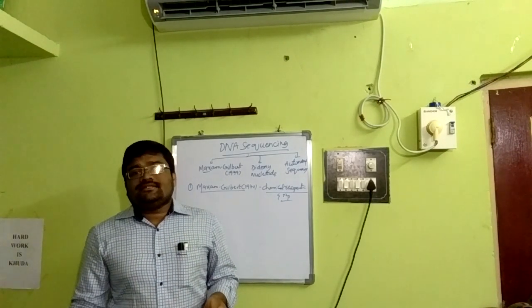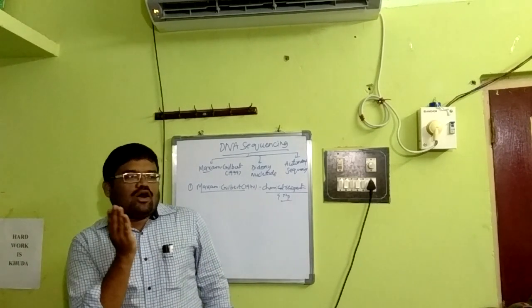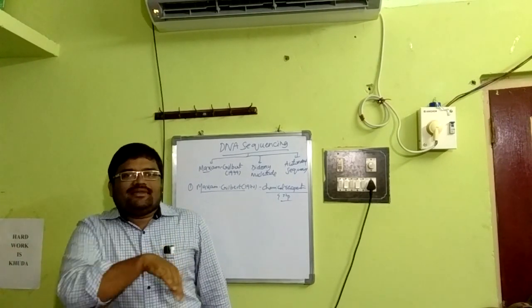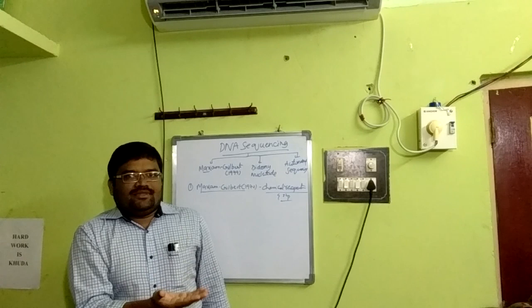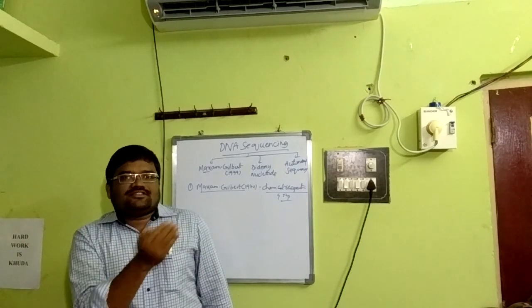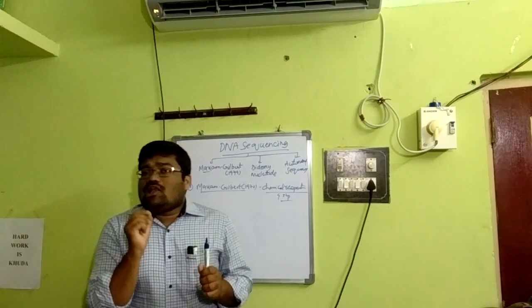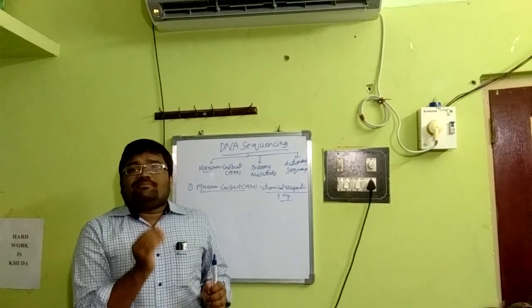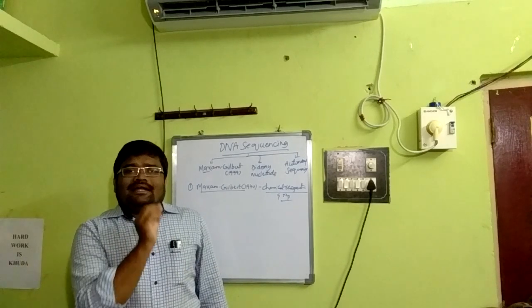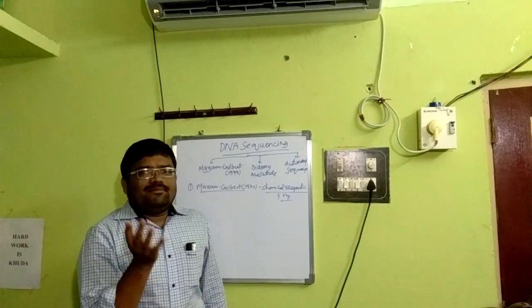Chemical reagents in the sense that one particular chemical reagent will break down one particular base. Dimethyl sulfate, DMS, for example, targets G residues. Based on this logic, they established a technique for DNA sequencing. It is called Maxam Gilbert.